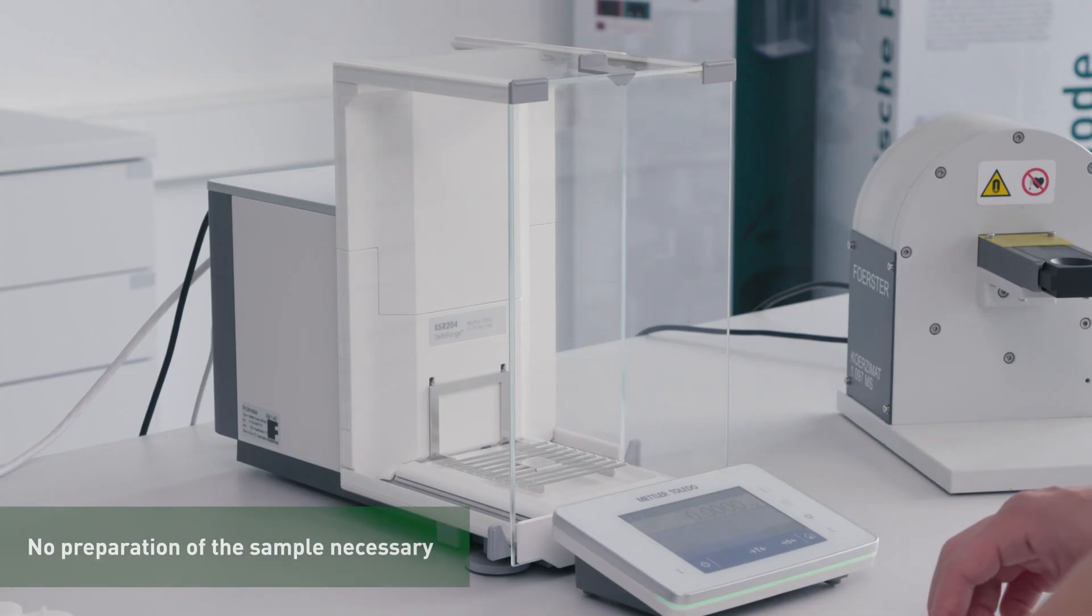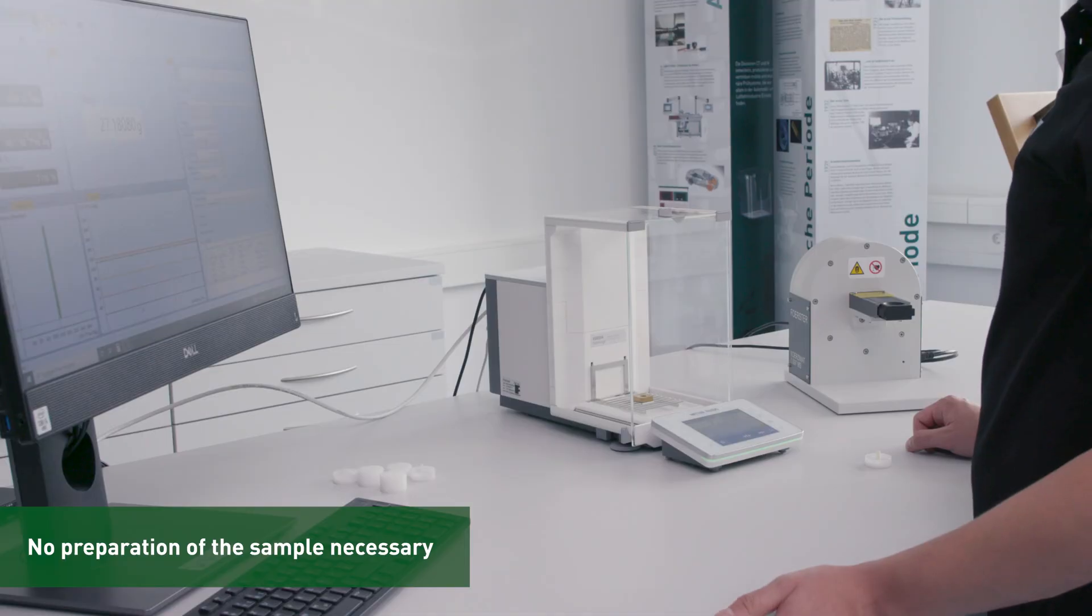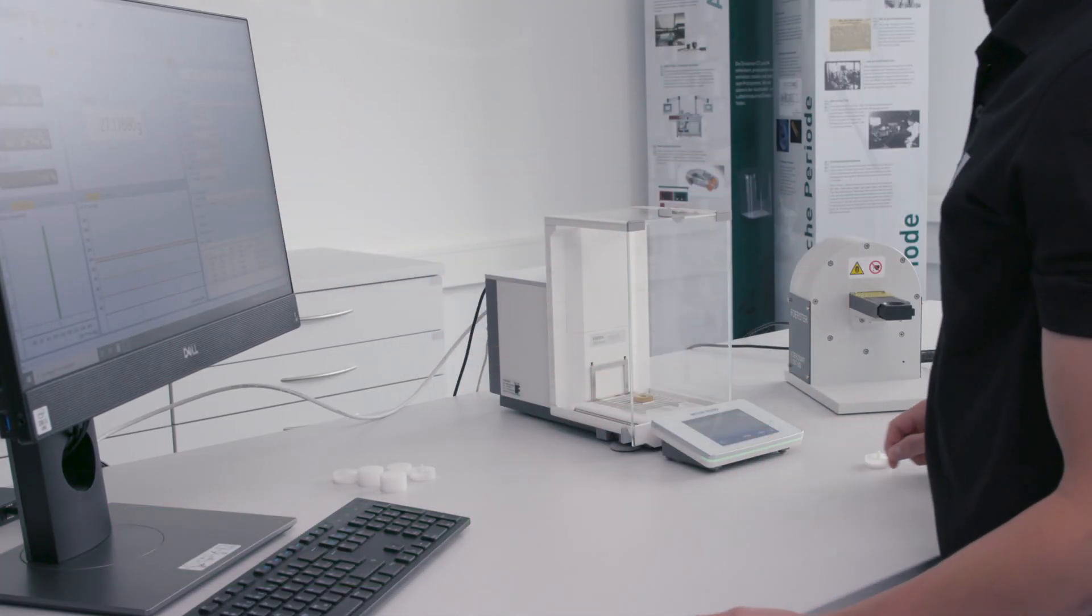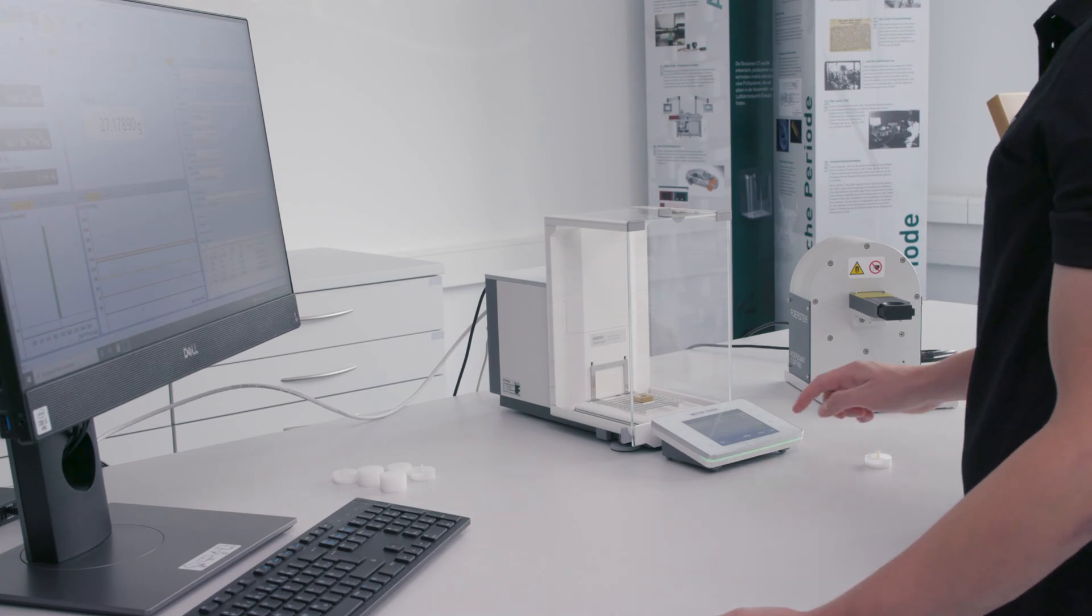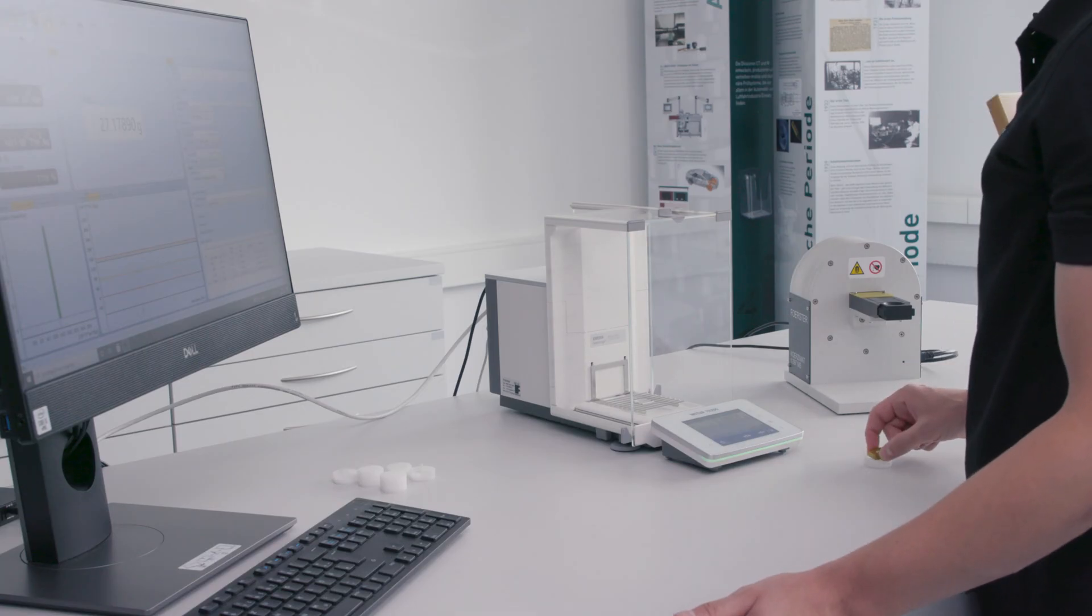The measurement procedure requires no sample preparation thanks to the measurement method of open magnetic circuit, according to IEC 60404-14 and ASTM B 886 standards.